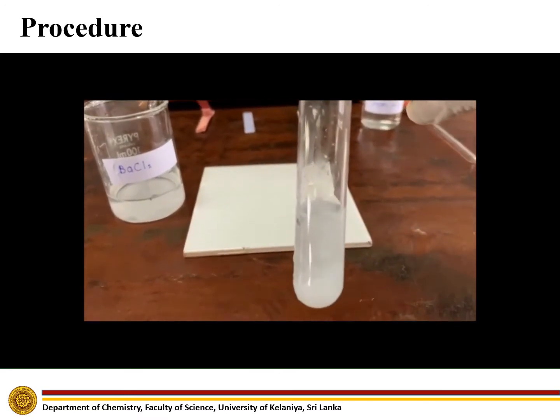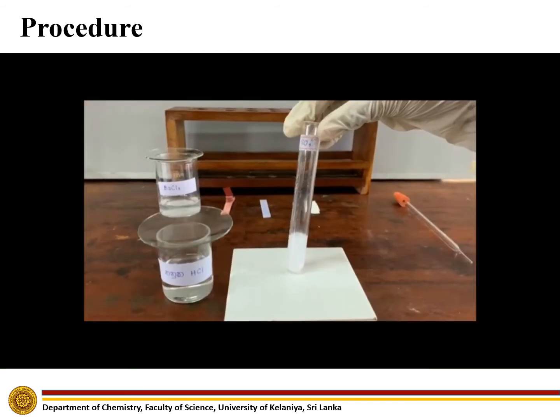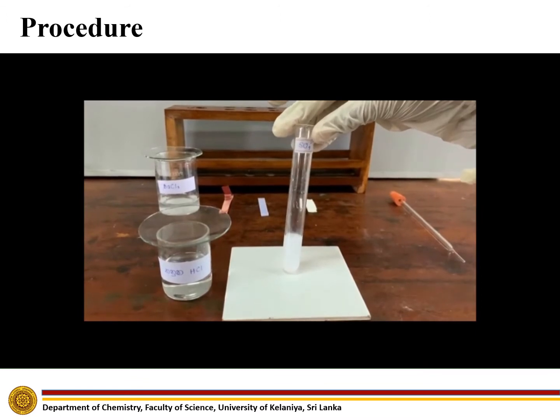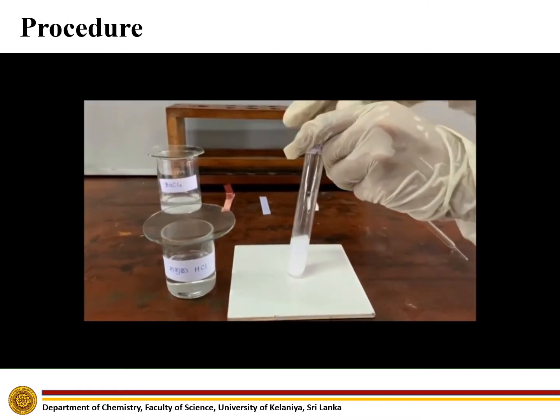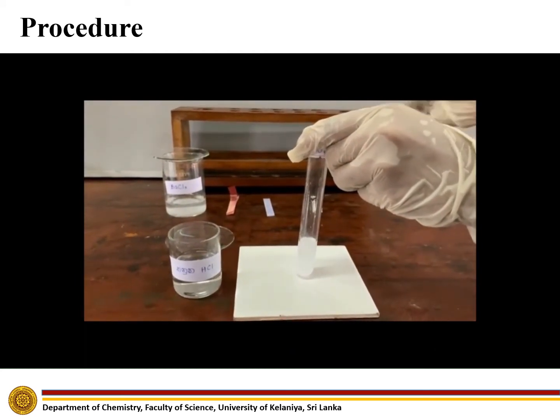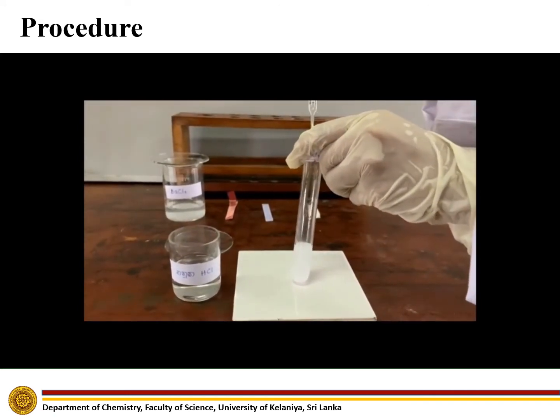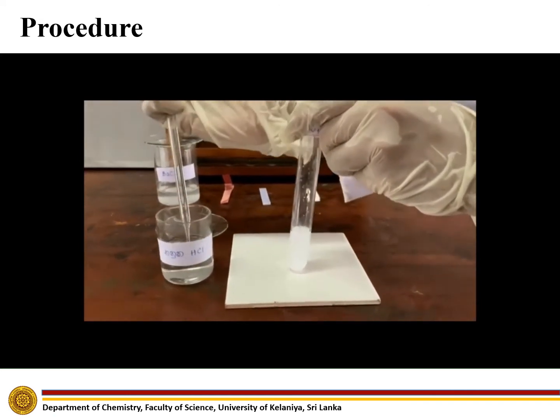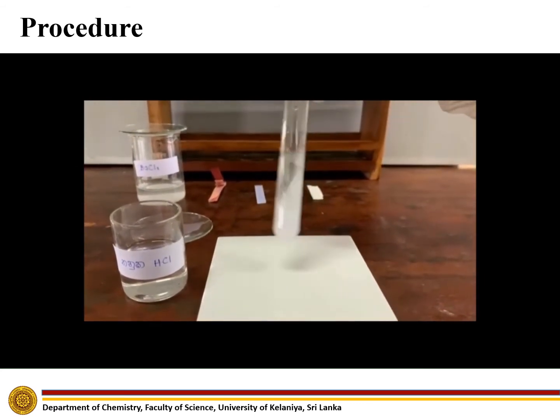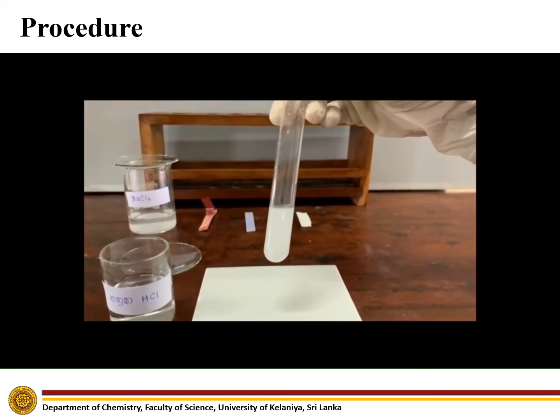A white precipitate is observed. Then add dilute hydrochloric acid to the precipitate. The precipitate will not dissolve.